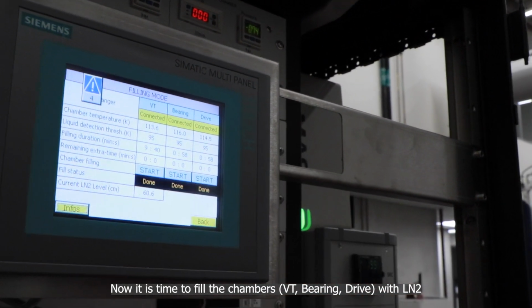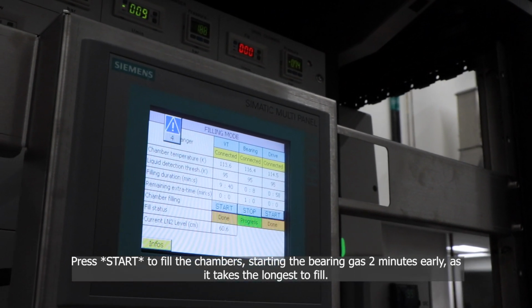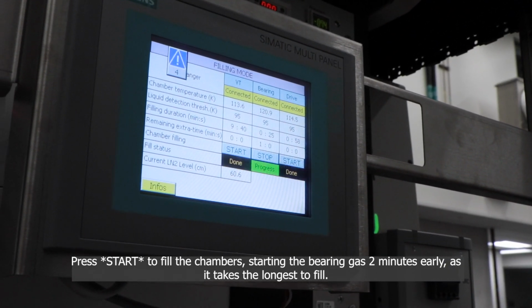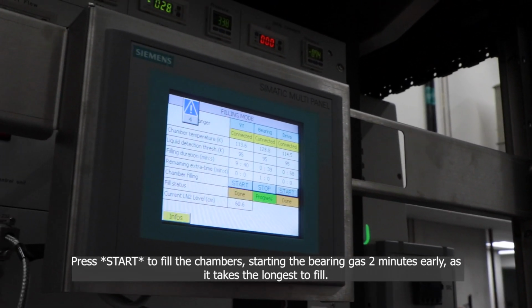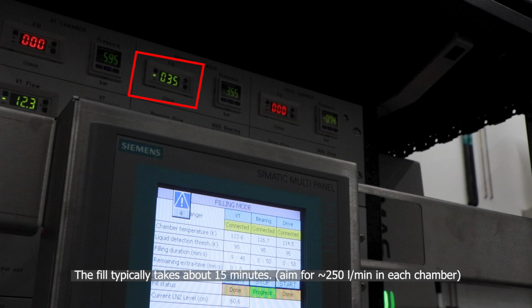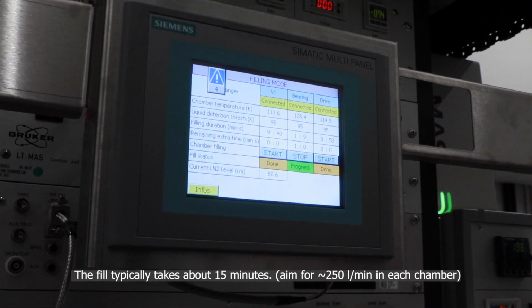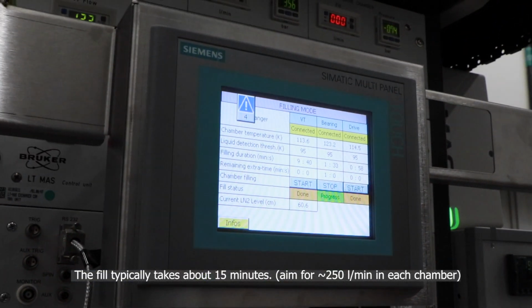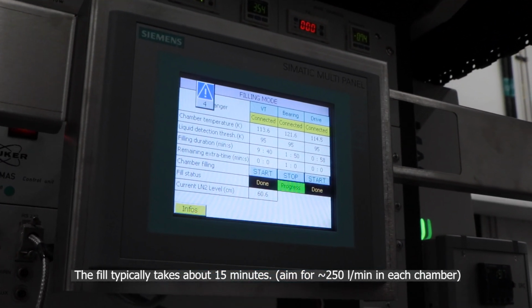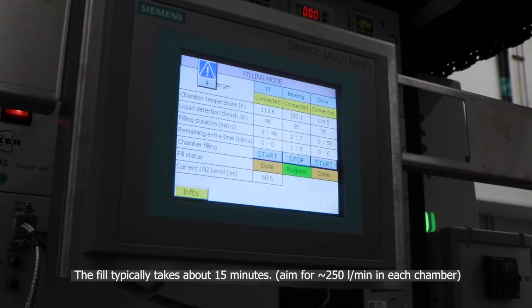Now it is time to fill the chambers with liquid nitrogen. Press start to fill the chambers, starting with the bearing gas, 2 minutes early or 3 minutes early, but usually it takes the longest for us to fill. Filling the chambers typically takes about 11 to 15 minutes.